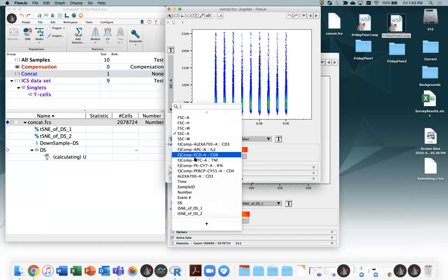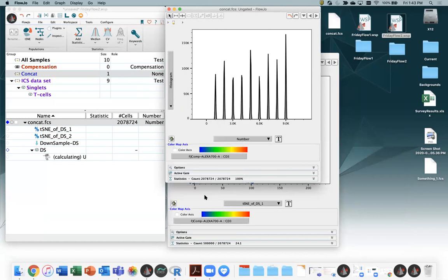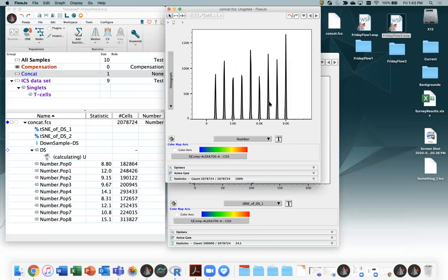If you show this as a histogram and right-click on it, hit gate on peaks, you can break these back up as our individual files, so that at any point we'll be able to see what the unique contribution of any one file is. We'll expect some differences in this data, as some are completely unstimulated, some are stimulated just a tiny bit, and some a lot.